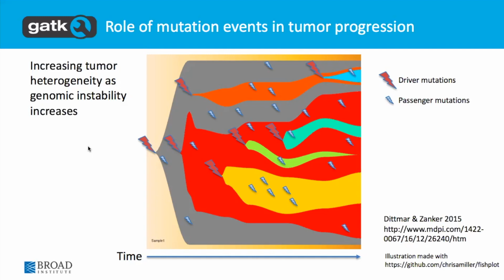And so we're no longer going to be able to rely on the classic expectation of, oh, I'm a diploid organism, so either all of the reads support my variants or half of them support the variants, right? Now that expectation goes out the window, and I will have different allele frequencies, different levels of support for the variant in the data that I'm generating from the tissue. So a lot of the complexity that we deal with in somatic contexts comes from there. Does that make sense? Okay.